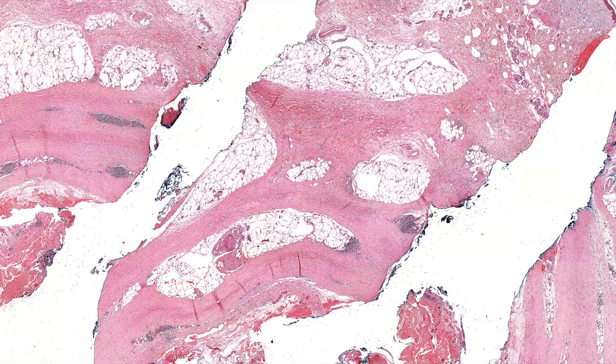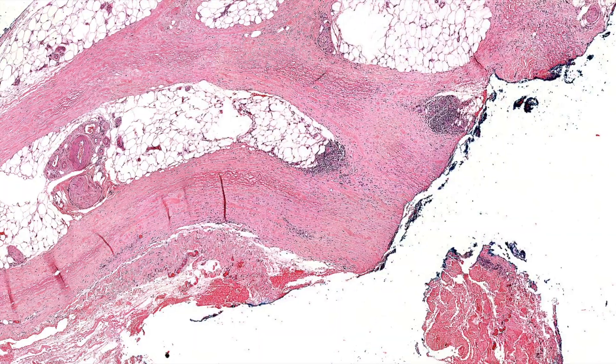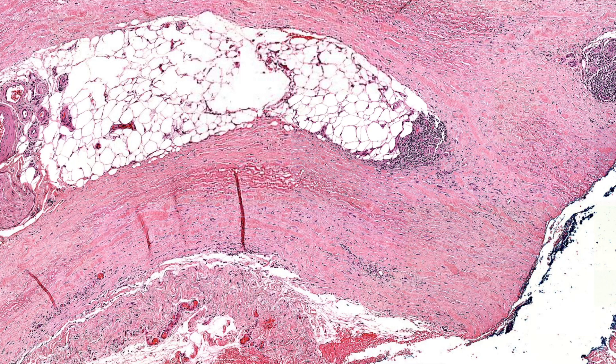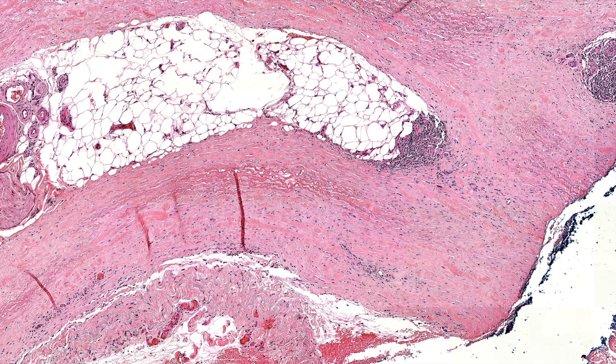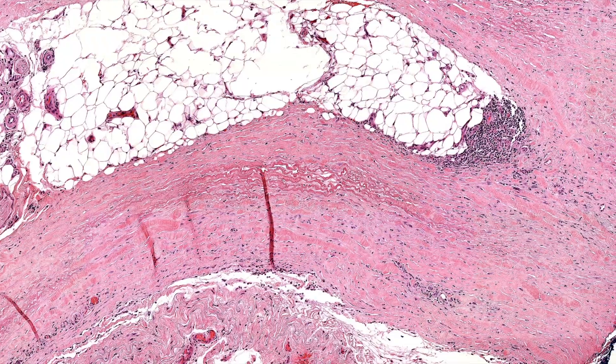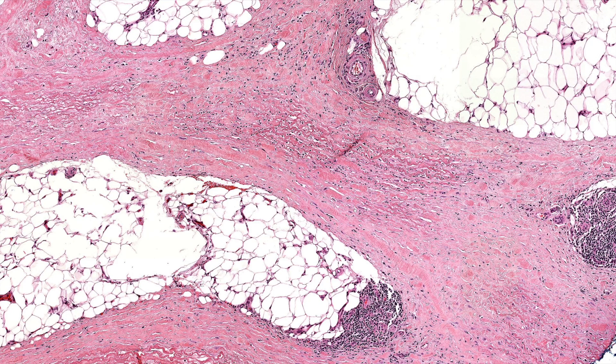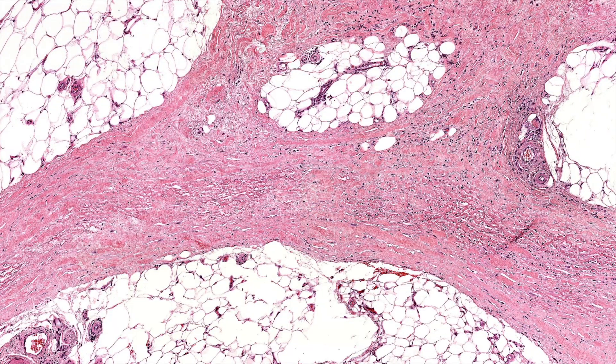Now, why is it called eosinophilic fasciitis? Well, you would expect there to be eosinophils, and sometimes there are, but they don't have to be. EOs may be present, sometimes even abundant, but there are many cases that have no EOs at all. You could think the collagen looks eosinophilic — I don't think that's why it's named that way. Some of the earlier cases that were recognized had EOs, but we now see cases that don't. So don't expect EOs to be there despite the name — it's a bit of a misnomer.